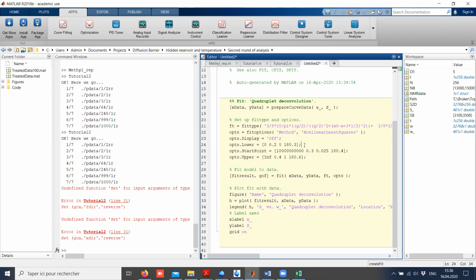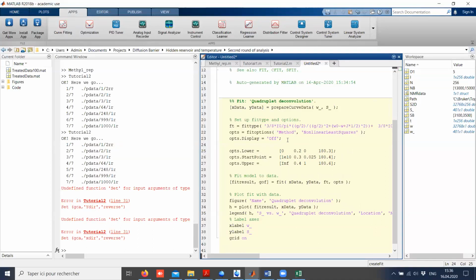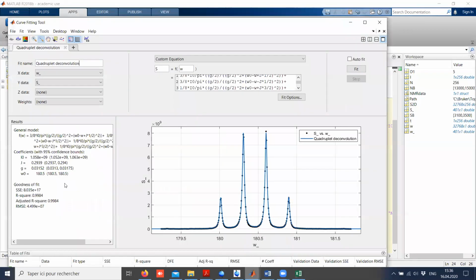And this is important. I'm going to align it so it's clearer to read. I'm going to align these numbers and explain what they mean. These are my fit parameters. Unfortunately, you have to remember how they are ordered, and I always forget. It's in alphabetical order, and it starts with capital letters, and I never remember how the numbers are taken into account.